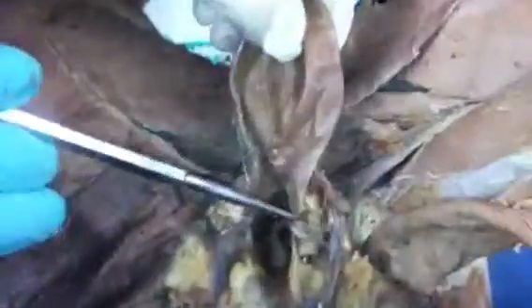Urogenital sinus. Do we have it? That's in the female, which we don't have. The uterine horn. That's okay. That's all females. That's the difference. The vas deferens. That's the little white silvery thingy on the side. Right here. This is the vas deferens. It goes up, and then behind the bladder and down the penis.